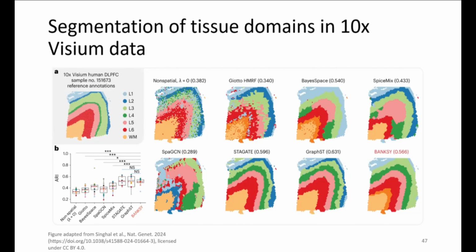And the non-spatial transcriptome, this is what you would do when you treat all these dots in space as if they were individual cells. You forget about the space, and then you group them based on transcriptional similarity. And you would say, okay, these look transcriptionally similar. And you can see that this works quite well. It closely resembles what has been assigned as a ground truth. But you see this kind of noise in terms of space, right? Which comes due to the noise that we have in the transcriptomic profiles.